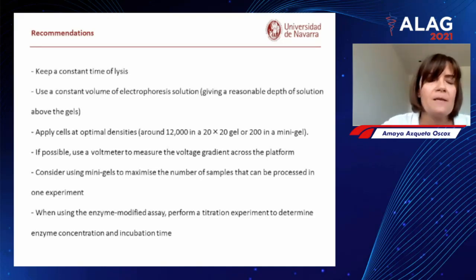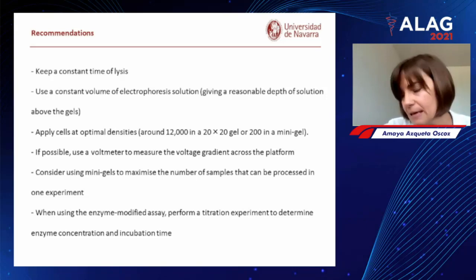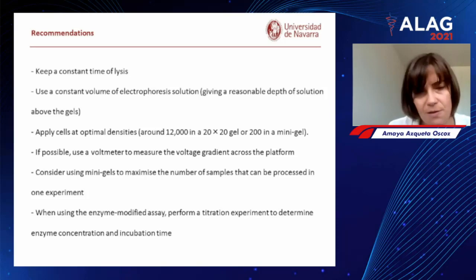institutions. So first, keep a constant time of lysis. As we have seen, the lysis, depending on the lesion we have, has a great impact on the results. And the lysis step is a moment in the Comet assay where you can stop. So you can stop and you can start again in an hour or in 2 hours or the next day.